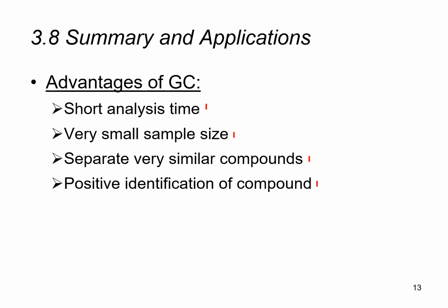We also realized that the retention times can allow us to create a positive identification for each compound, because each time a specific chemical component passes through the instrument, it will elute with a very fixed retention time.